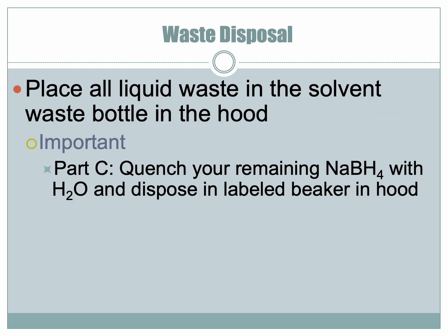So you'll place all the waste in the solvent waste bottle in the hood. In part C, you have to quench the remaining sodium borohydride with water and dispose in the labeled beaker in the hood. So sodium borohydride is very reactive. If we put it in the waste bottle, it could react with something that we're not intending it to react with. So it's important that we make sure that it's done reacting before we put it into the waste. The way that we do that is by adding water. Water will make the sodium borohydride react so that if we put it in the waste, it won't react with anything else.